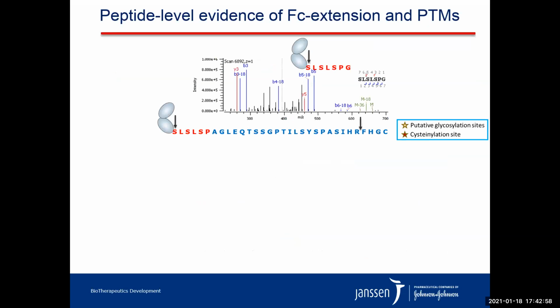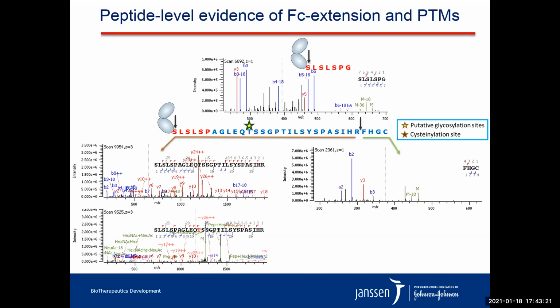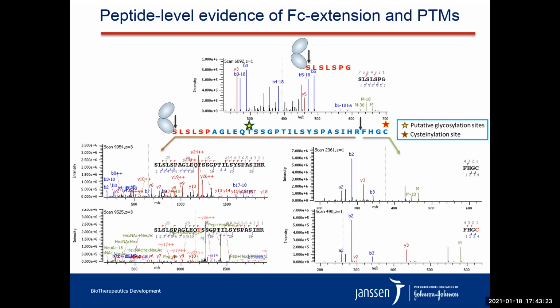The results of this experiment show the identification of the major product with the expected C-terminus ending with the glycine residue. And PSM shows extension sequence ending with cysteine. PSMs of both the unmodified and modified sequences can be easily assigned, and modifications can be assigned to these sequences.